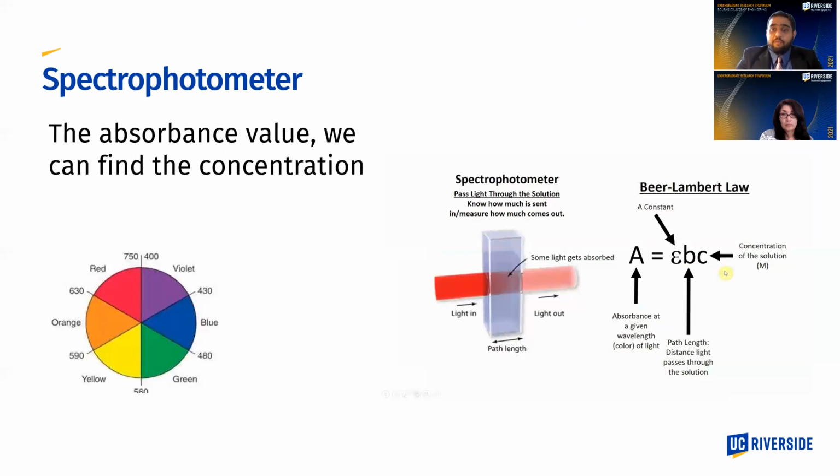Here I go more in detail on what I do with the absorbance value. Since absorbance is a measure of how much light passes through a solution, I can use the Beer-Lambert's law and correlate this to concentration. Going back to the coffee example, the strong cup of black coffee just had more stuff in there. Alternatively, the lighter cup of coffee had less stuff in there compared to its total volume. Using this, I could then derive some idea of what the cell density of the solution was, and therefore a rough approximation of how many organisms were also in the solution.